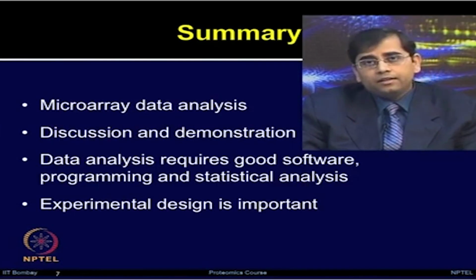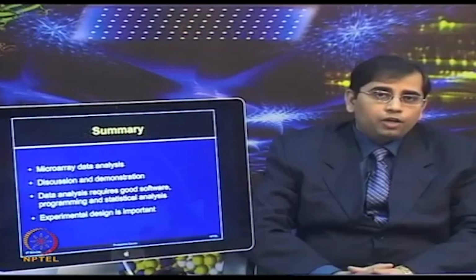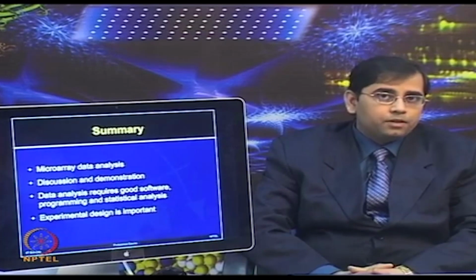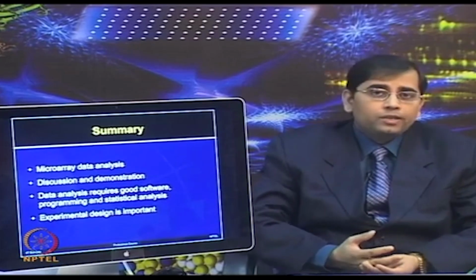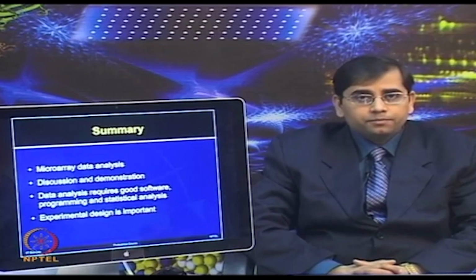Experimental design is very important in these microarray based experiments. If you put garbage in, you should expect garbage out. So you have to first plan your experiments, your controls, all of those things very carefully before starting any microarray experiment.